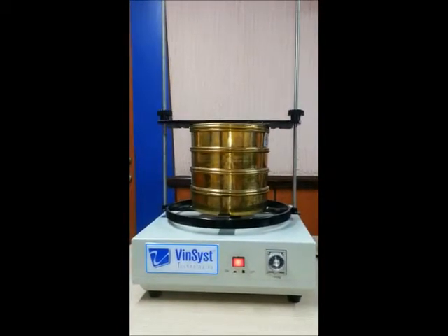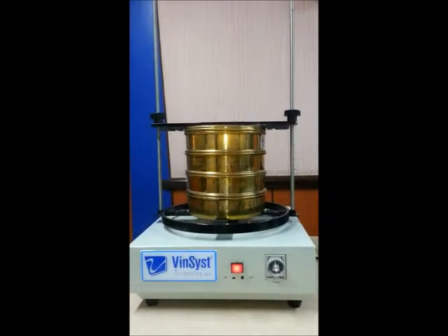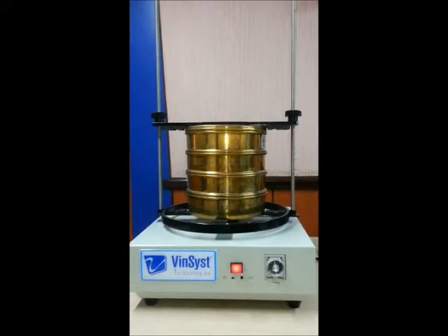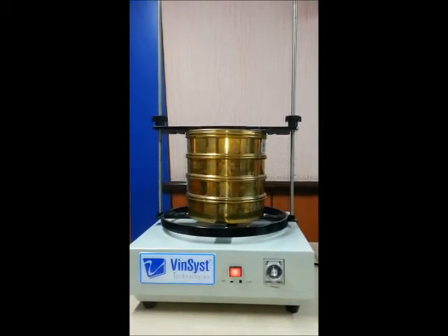It has a 3-dimensional sifting motion and very low noise. This system can take up to 300mm diameter sieves, and it can stack up to 8 sieves of 50mm height and 16 sieves of 25mm height.